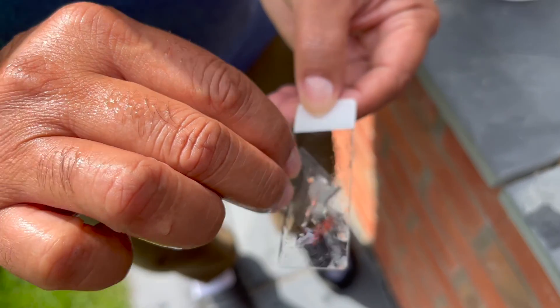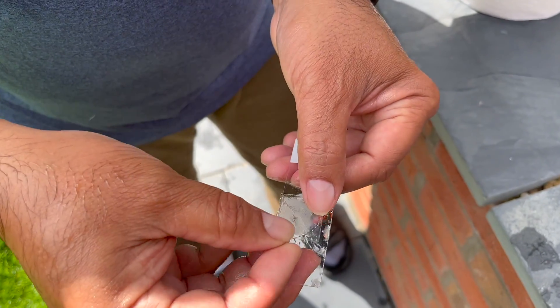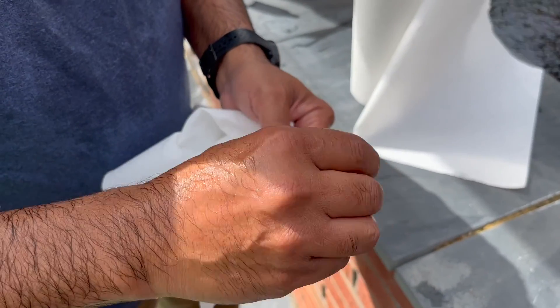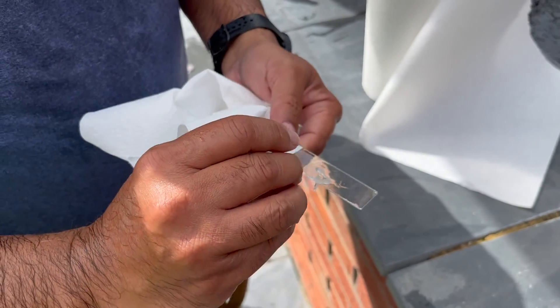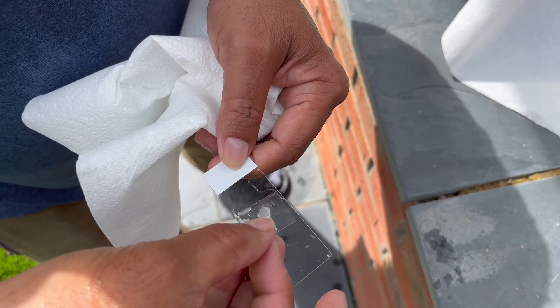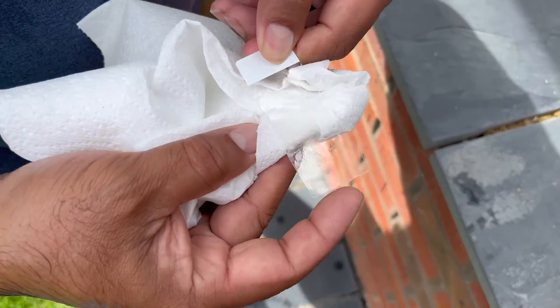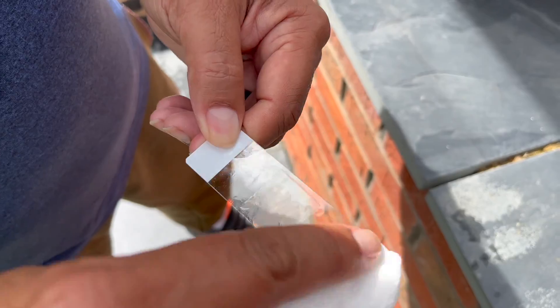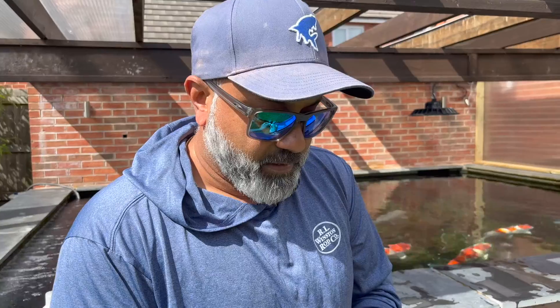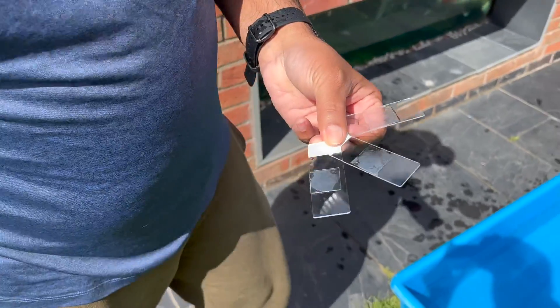We take the mucus samples and bring them together, close it down, cover it, and bring it into the middle. Here I'm preparing the slide — get the mucus sample in the middle, push it down, and clean all around it. Same for the rest — ready to go to the scope, three different parts of the koi.